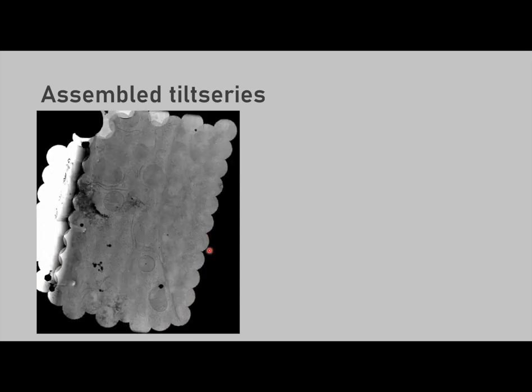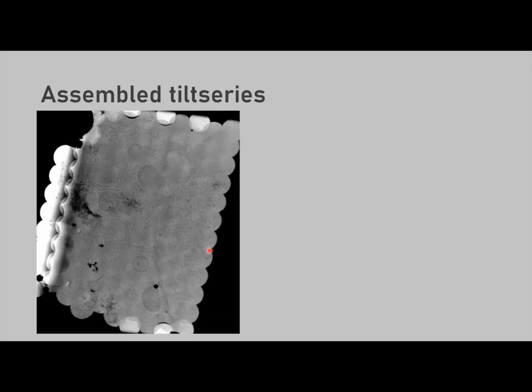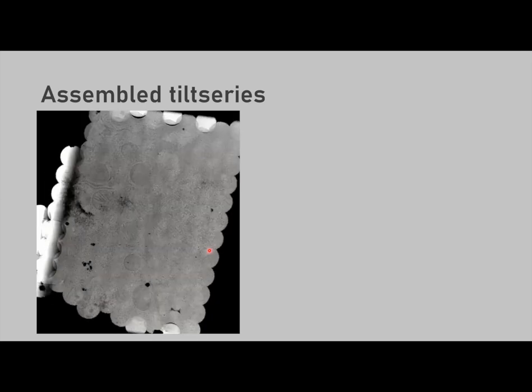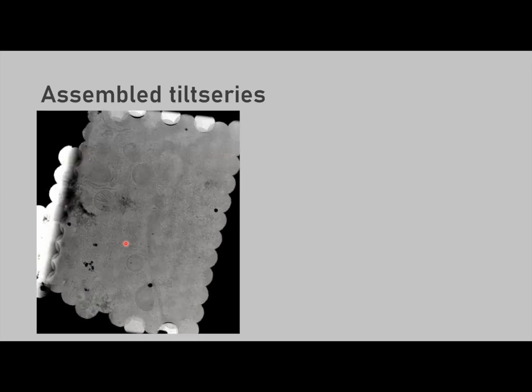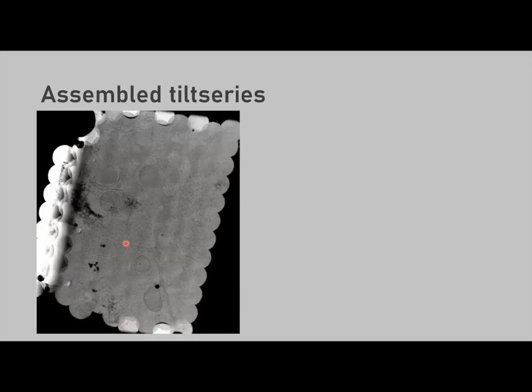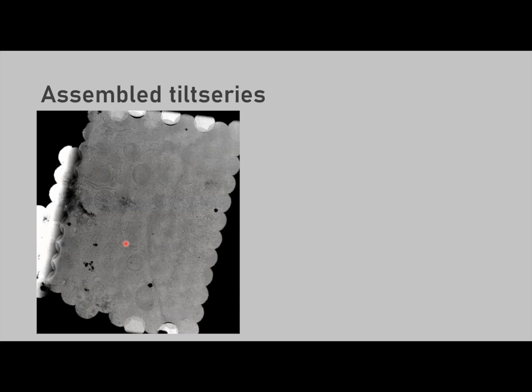I'm sure it should be possible to do this, but I'm not quite there yet. The other issue is you might notice that that's not a very extensive tilt series. I'm only tilting plus minus 15 degrees here, and the reason for that is it takes a long time to collect this.